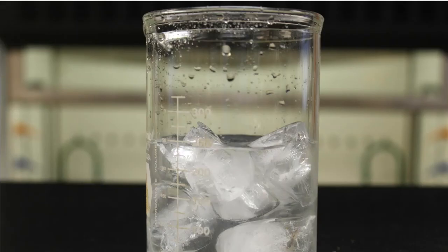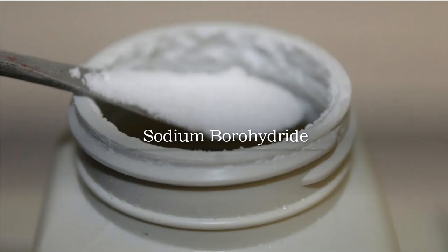So I'll take some of the ice cubes. I'll put them into a beaker. I'll add some water. And I'm going to set this over to the side until I'm ready for it. Next is my sodium borohydride. And folks, this is what sodium borohydride looks like. So this is straight out of the container. You can make observations if you want to.